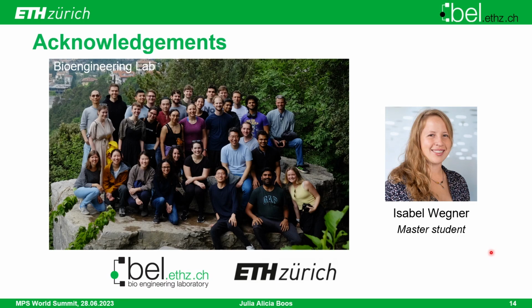Thank you for the great talk. I'm wondering if you observe any asymmetry condition in the EB. Because of the placenta, there's a communication between the placenta and the EB, right? So I wonder if there's any asymmetry formation, placenta side and the non-placenta side. I couldn't understand, sorry.